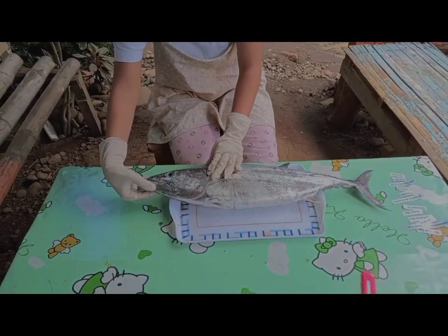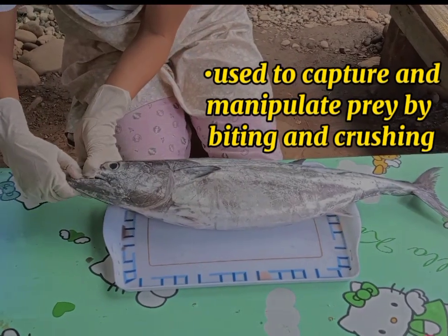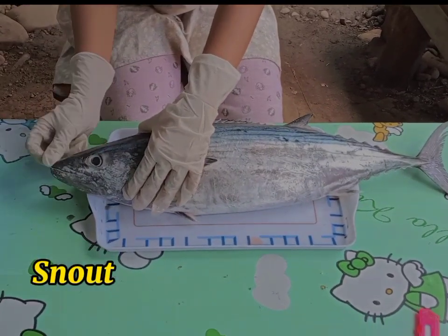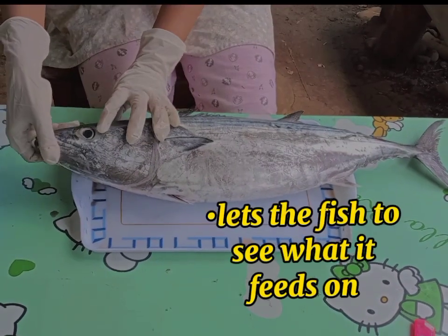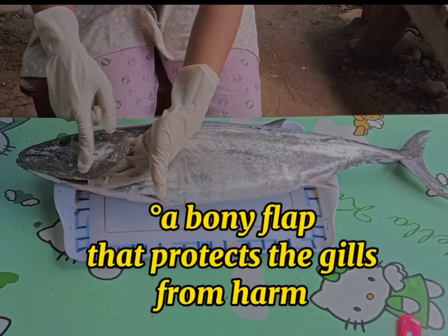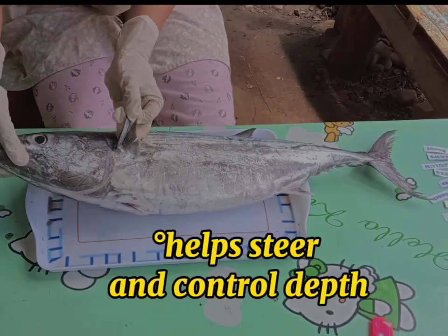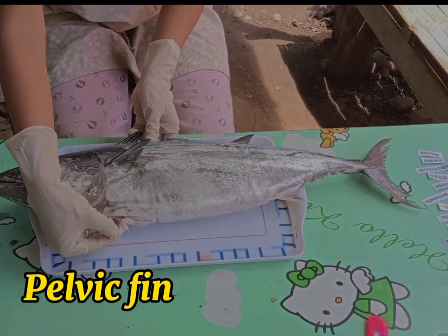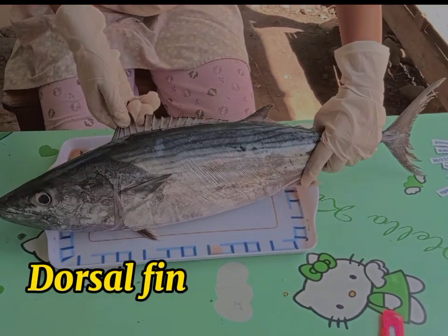First, this is the jaw. Next, the snout — this is the snout. The eyes. Operculum — this is the operculum. Next, the pectoral fin. The pelvic fin. The dorsal fin.